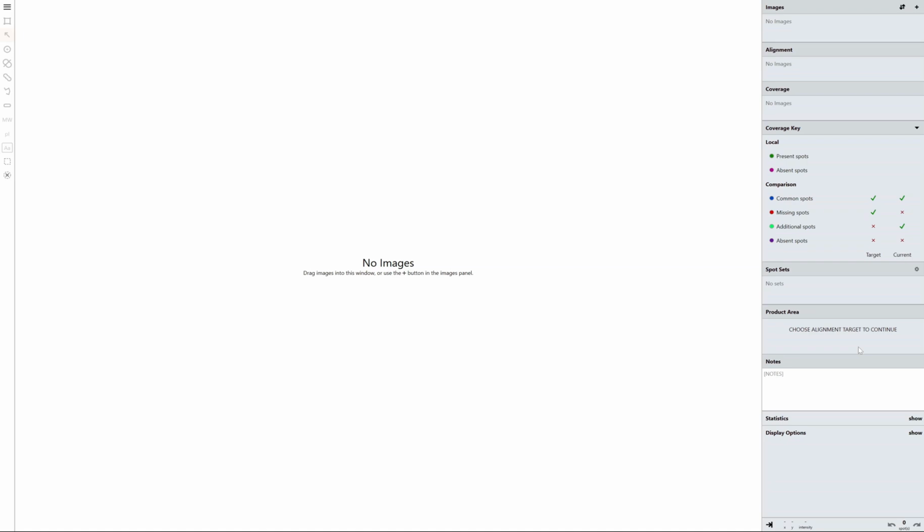Hello everyone. Today I'm going to be guiding you through an end-to-end workflow of how I would take 2D Western blot, 2D gel, 2D dye, whatever it may be, images, and use those to calculate my anti-host cell protein antibody coverage. Now, as I mentioned, SpotMap doesn't really care what experimental technique you've used.